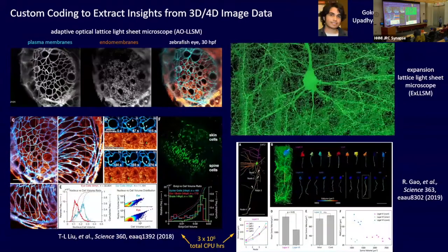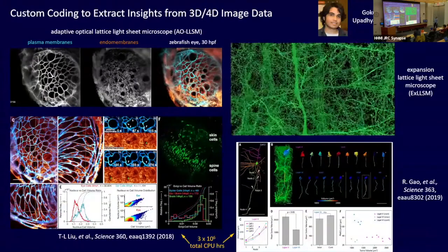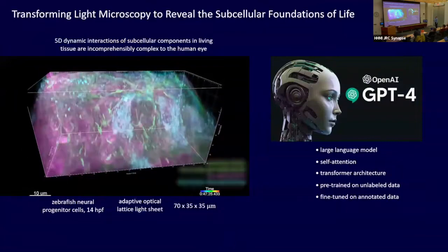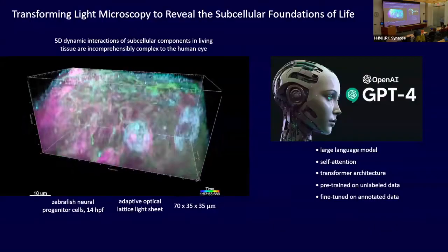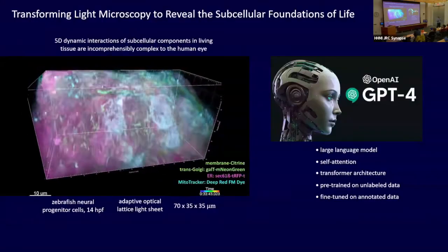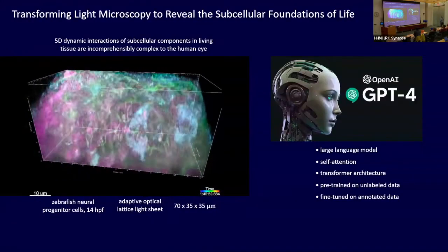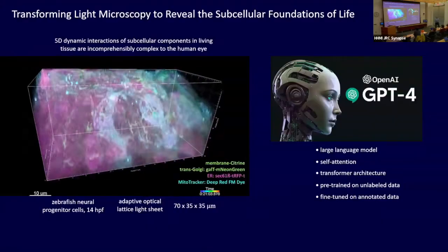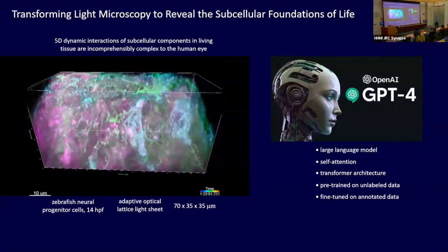So we have to find other ways to be able to analyze data at the terabyte to petabyte scale. This is where my proposal lies. I'm the biggest skeptic about ML in microscopy that you will ever find, and yet I have been led to believe that ML is probably the only way we're going to get analysis tools that are scalable at this size of the data.